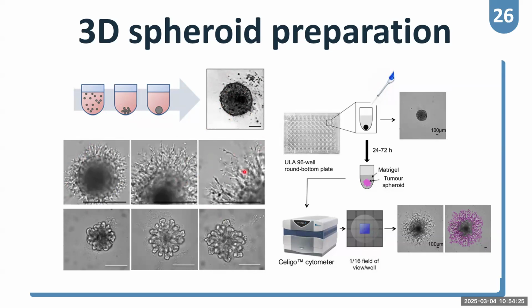Okay, the difference between the two, proliferation and migration. In proliferation, you can see it doesn't have legs growing out. It means it maintains the structure in the matrix gel. We use just 2.5 to 4% of matrix gel.